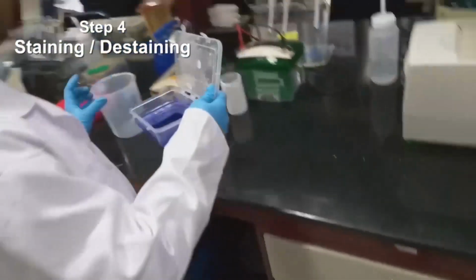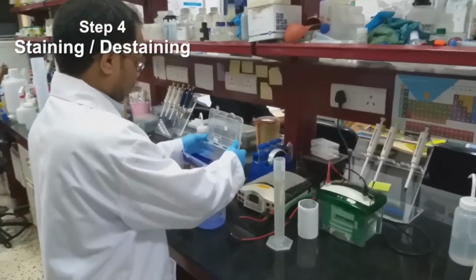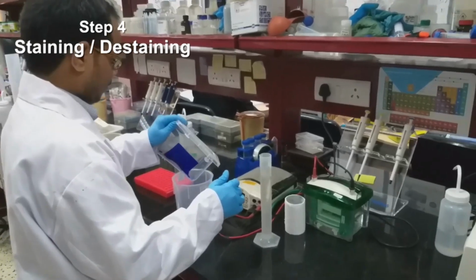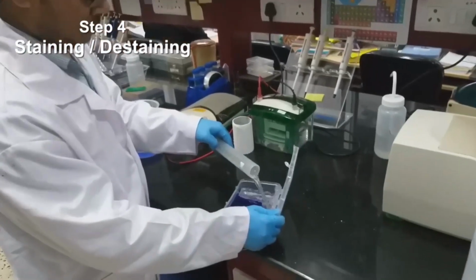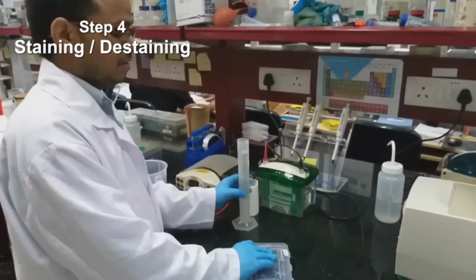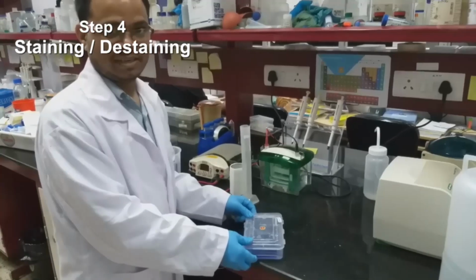So we remove the solution. Then I am going to add destaining solution, and I will keep this on a rocker for 2 hours for destaining.